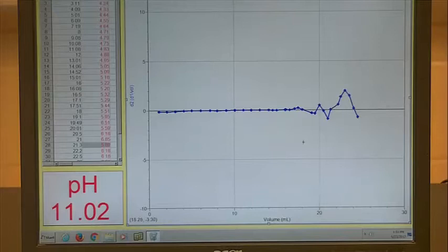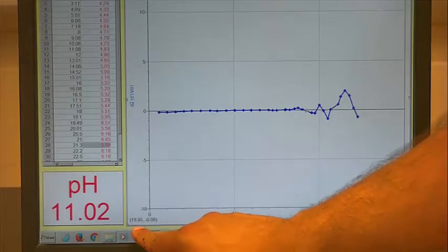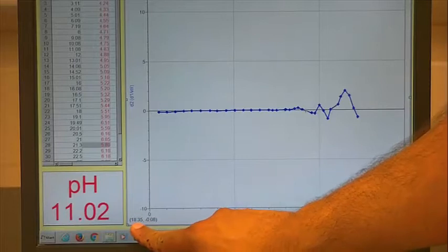And here it crosses the x-axis about here. Okay, so you could actually get the accurate volume if you click here where it crosses the x-axis, it's about here. So if you read the volume here, that's about 18.35 mils.